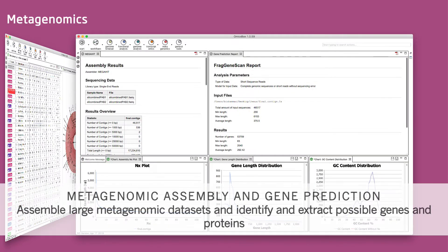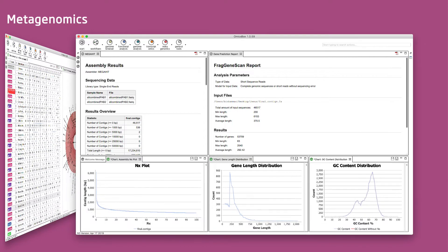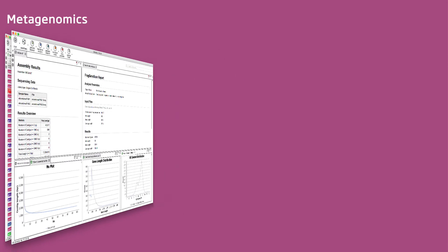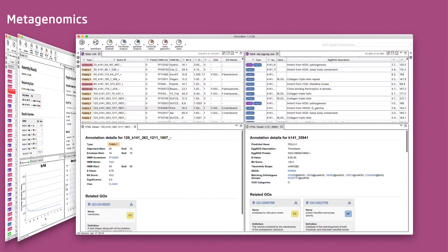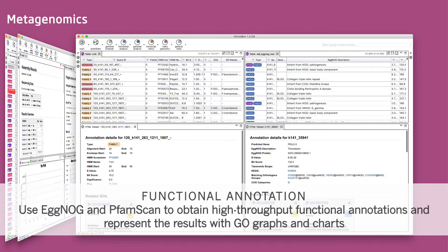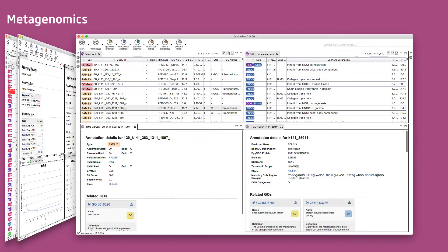Metagenome assembly and gene prediction can be done with several different algorithms like MetaSPAdes, MEGAHIT, Prodigal, and FragGeneScan. These tools can be combined as workflows in many different ways. Large-scale functional annotations can be performed via PFAM and EGGNOG to obtain gene ontology and pathway labels for downstream sample comparisons.